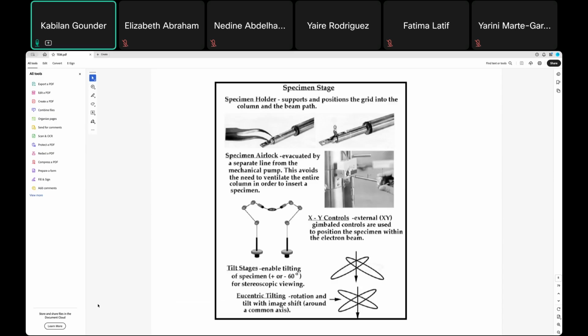I don't want to go into details about all the parts and each component. From an exam point of view, there is no need to read all these, but you should basically understand how small the parts we are using are, while the images are increased to 500,000 or 600,000 times magnification to see things. As mentioned, for the smaller pieces, we take an ultramicrotome cut.